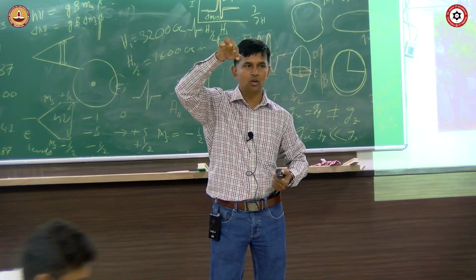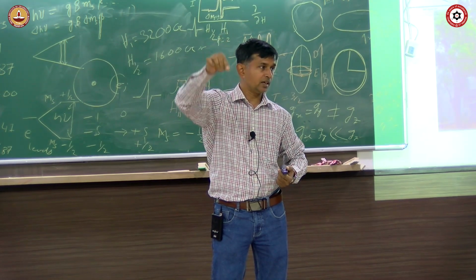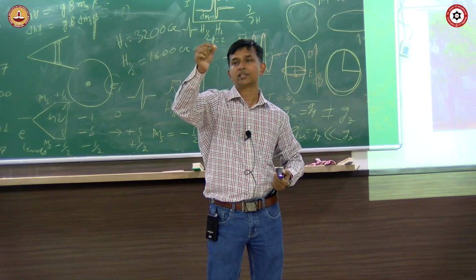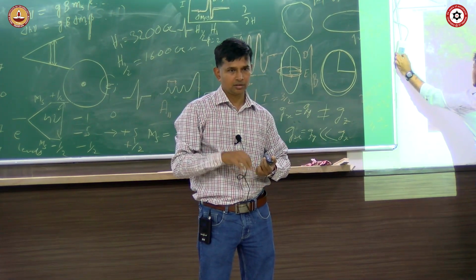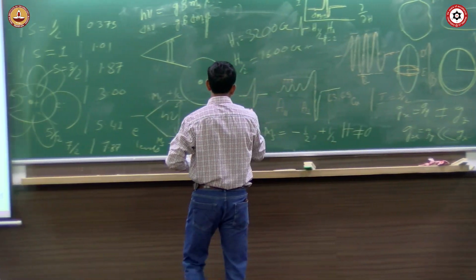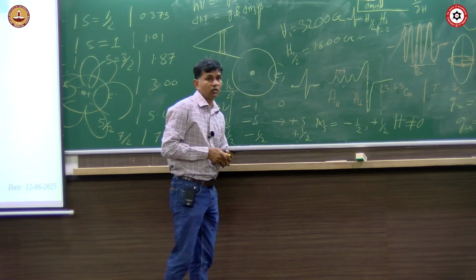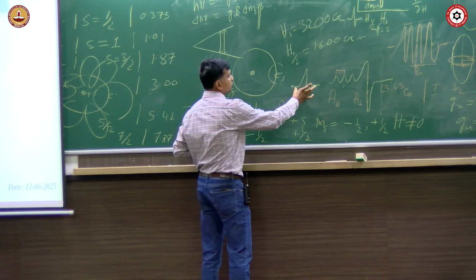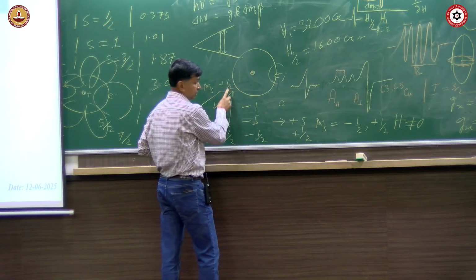Now I have the same electron on a carbon atom. I take one carbon atom, I put one electron, and it becomes carbon dot minus. Now if I take an EPR signal, how does it look? It looks like this, and then a tiny amount, two satellites, will come. Why should I get the satellites as well as the big feature? This is the feature for this transition.